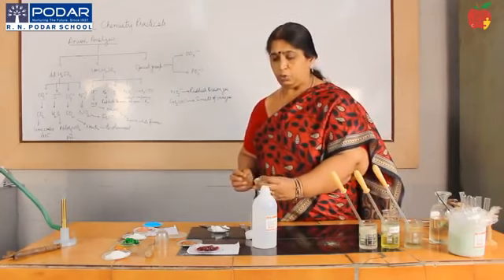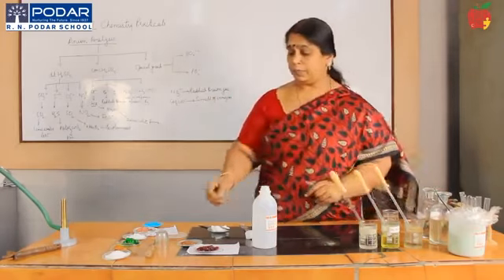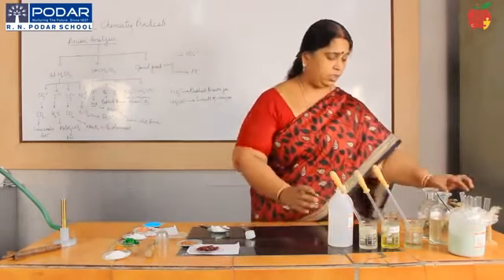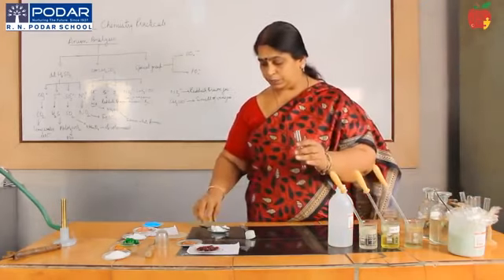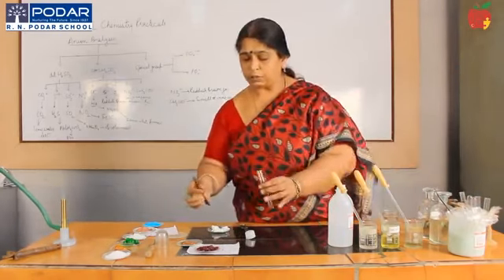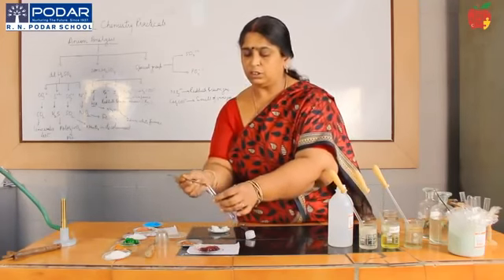That was for the carbonate salt. Let me now go with an example for the concentrated sulfuric acid group, where let me take a nitrate salt. Okay, so let me take a test tube. We take a nitrate salt. I am just taking cobalt nitrate as the example here.